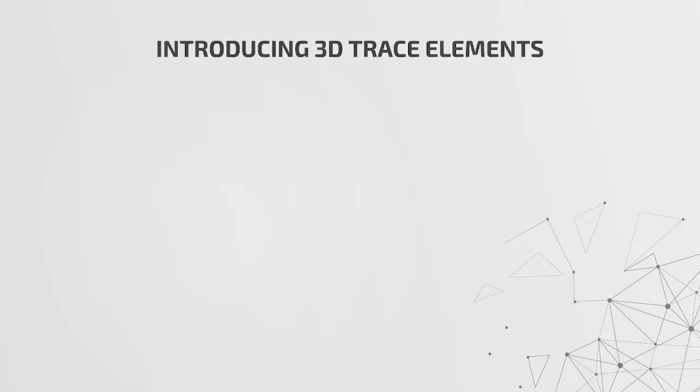So with that theory out of the way, let's talk about our new 3D Trace Elements DRS. It provides time-resolved multi-reference material calibration. So in that first graph that I showed, the calibration curve, that's not time-resolved because we're taking all of our results from our experiment to calculate that curve. And we're just using the one curve for the entire experiment. However, in this approach, you still get time resolution and you can still use multiple reference materials.